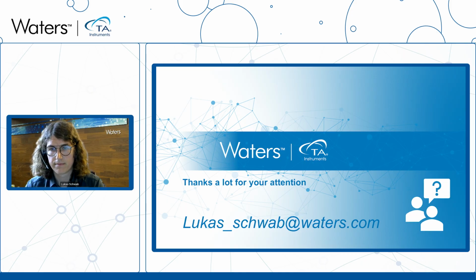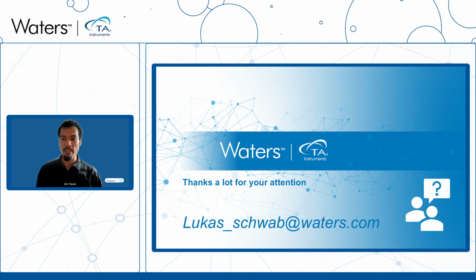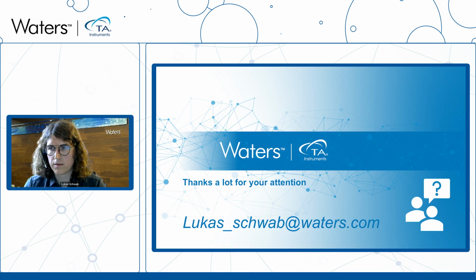Our next question is, when you compare the rheology versus the impedance results, you were mostly showing viscosity curves from rheology tests. But will you be able to extract additional information from oscillatory tests that give you a similar trend as shown in impedance results, since modulus will also give information on the slurry network? Yes, of course, you can also look at modulus and impedance at the same time, but to get modulus, you need to do oscillation testing.